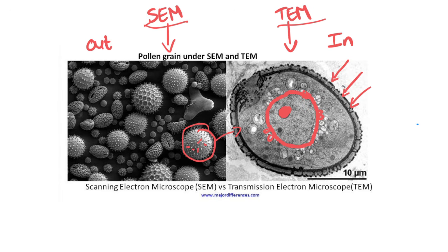Now, one last thing I want to point out to you is this little guy over here. This is a scale bar, and it tells us by how much this thing has been magnified depending on the scale. Now, when we use microscopes to show how big something is, centimeters, meters, millimeters, it's not small enough. So we need two different measurements. What we need is micrometers, which we write like this. That is a micrometer, which is smaller than a millimeter.